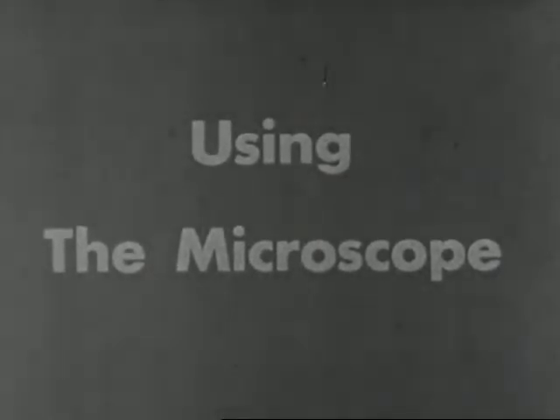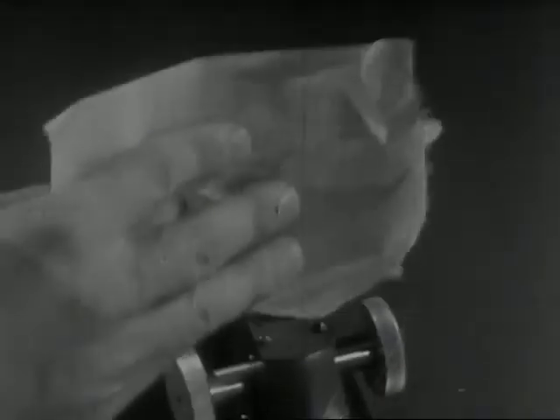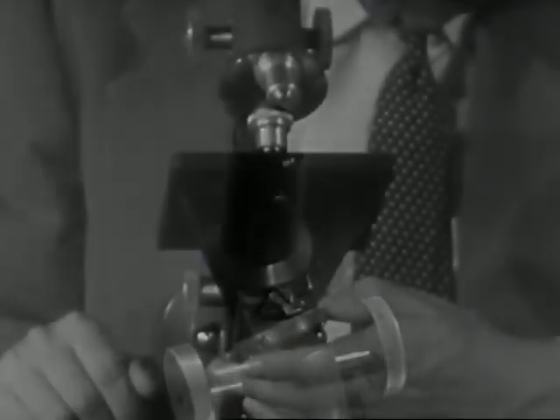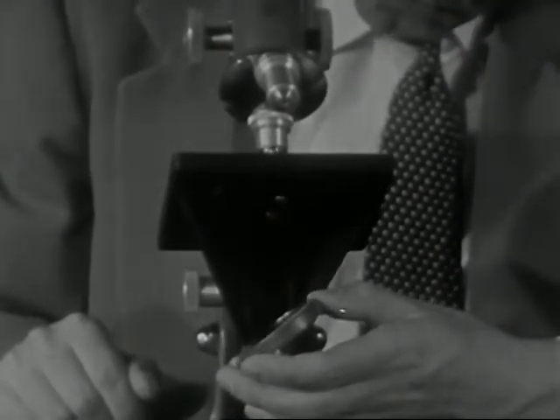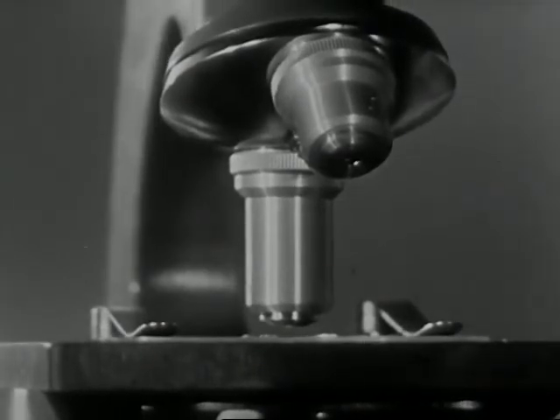And now let's review the most important rules for using the microscope. Handle the instrument carefully. It is delicate and expensive. Keep the lens surfaces clean with lens tissue. Adjust the mirror for even, comfortably bright light. Carefully adjust the objectives to a position near the slide.